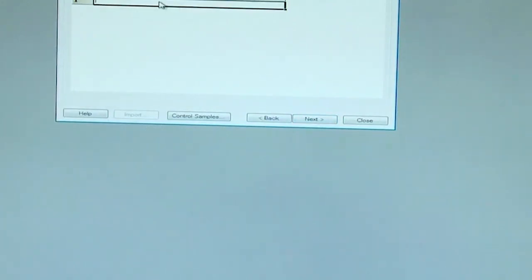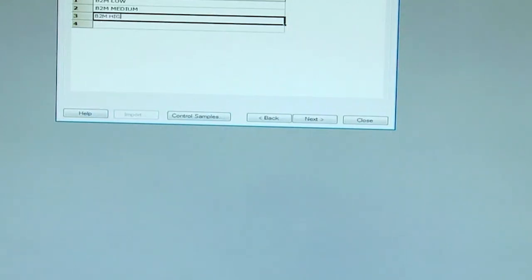Here, we need to fill in the name of all single concentration compounds. We would select our analyte as beta 2m. Just that we have one analyte, we will take it in three different concentrations. We will name as beta 2m low, beta 2m medium, and beta 2m high. Low indicates lower concentration, medium indicates medium concentration, and high indicates high concentration.